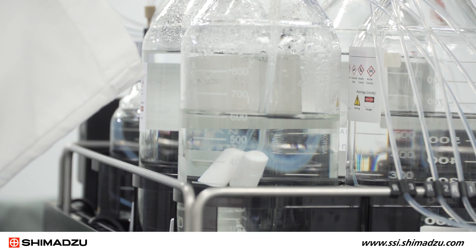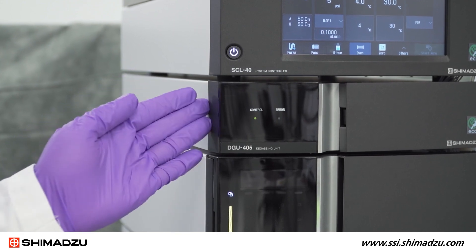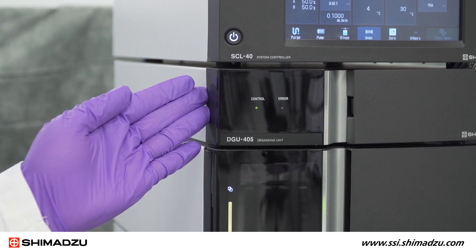Our sample needle in the auto sampler is also made of ceramic, as I will show you shortly. Next we have our DGU405 degassing unit in which the flow path is metal-free, making it inert for sticky molecules.